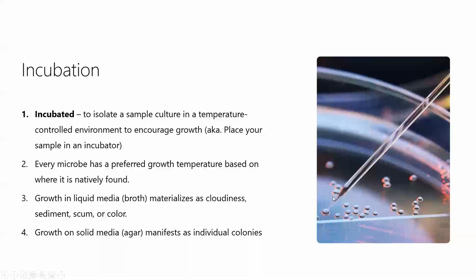When we added the bacteria to the plate, this is evidence that there was one microbe right there, and it multiplied into 2, into 4, into 8, and so on until it has a whole bunch of clones of itself. And each of these is evidence that we had growth from our original culture.